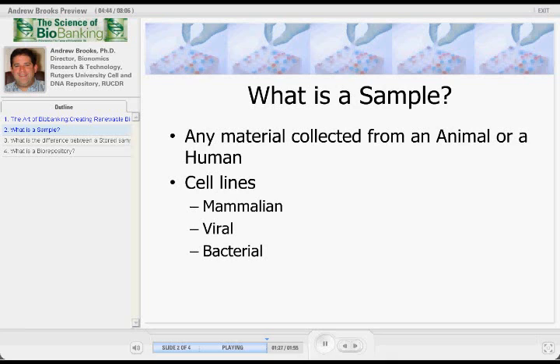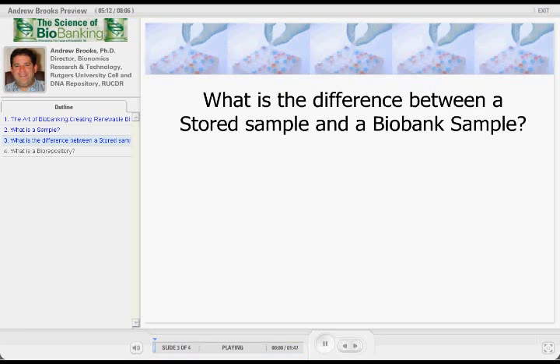Certainly, there are banks or samples that are specific to cell lines. Their list of services, their responsibilities are very different from a sample procurement and processing and distribution standpoint, but they're a sample nonetheless. And then certainly agricultural samples. And this is actually where there are huge banks. However, the resources for banking these samples are pale in comparison to working with animal and human cells. So the challenges there are different, not from a technology perspective, but from an operational and fiscal perspective.